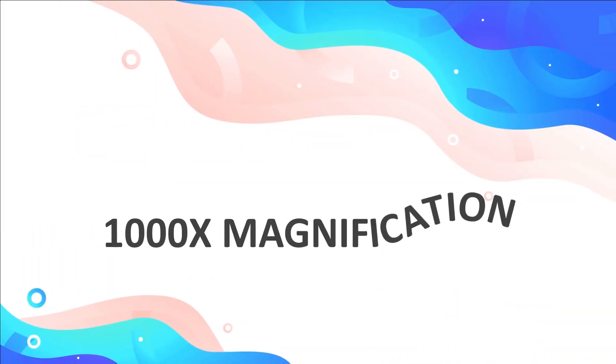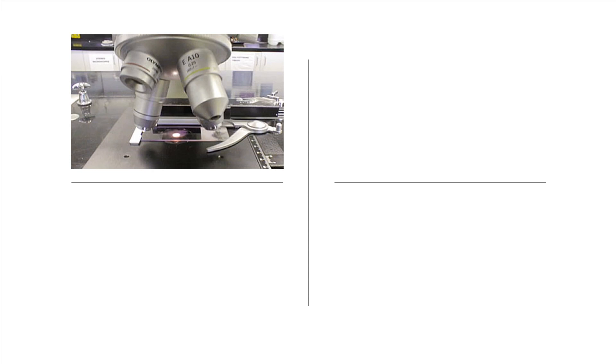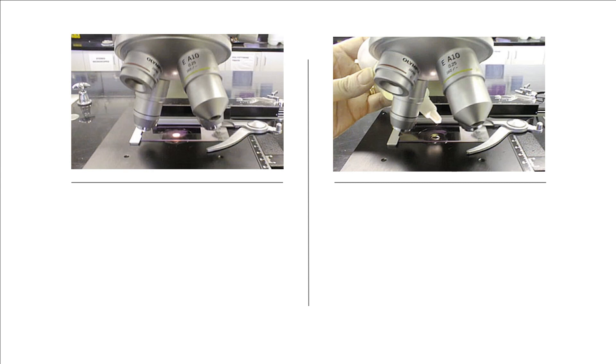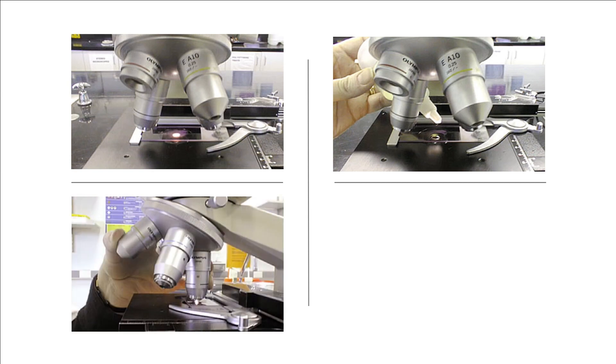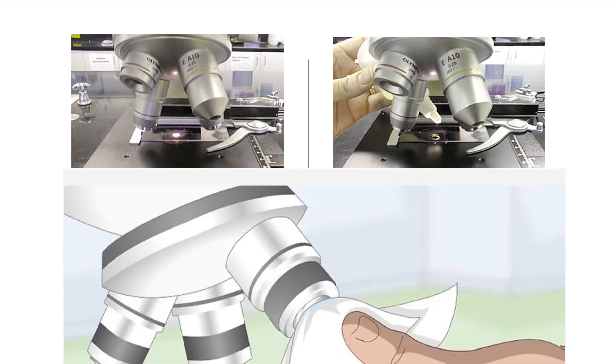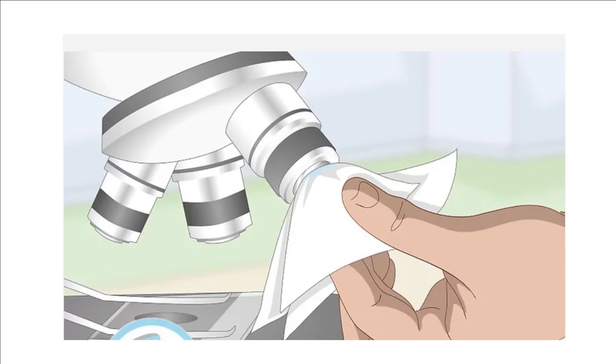If 1000 times magnification is required, this is what you need to do. After getting a clear image at 400 times magnification, then turn the barrel of the microscope so that the 40 times and 100 times lens are halfway between and directly over the slide or cover slip. Next, you need to place a drop of oil in the middle of the slide or on the cover slip. And carefully turn the objective lens until the 100 times magnification lens contacts the oil and snaps into position. You can adjust sharpness and clarity using fine focus knob. After the observation, remember to wipe off the immersion oil and clean the objective lens with lens tissue.